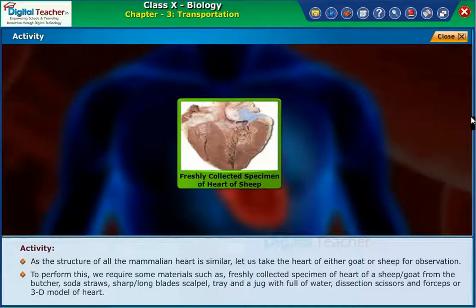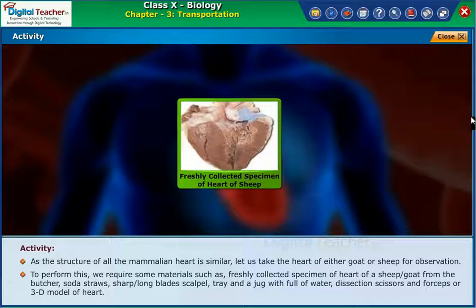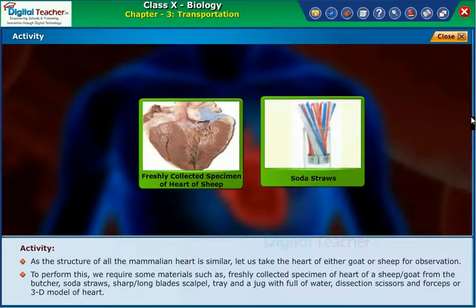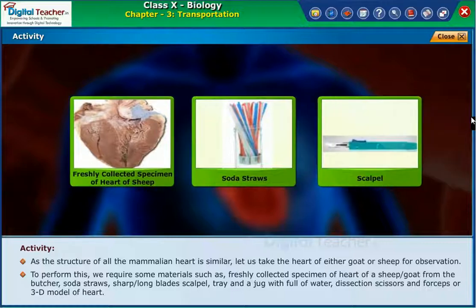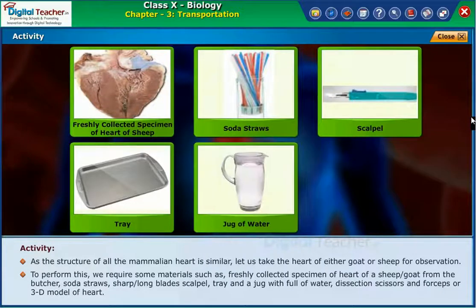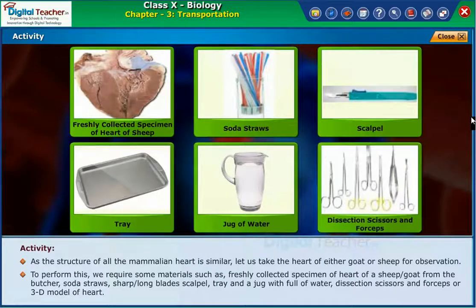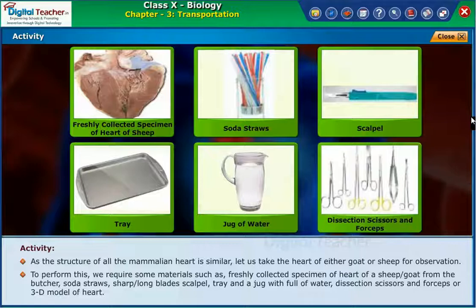To perform this, we require some materials such as a freshly collected specimen of heart of a sheep or goat from the butcher, soda straws, a sharp or long blade scalpel, a tray and a jug full of water, dissection scissors and forceps, or a 3D model of heart.